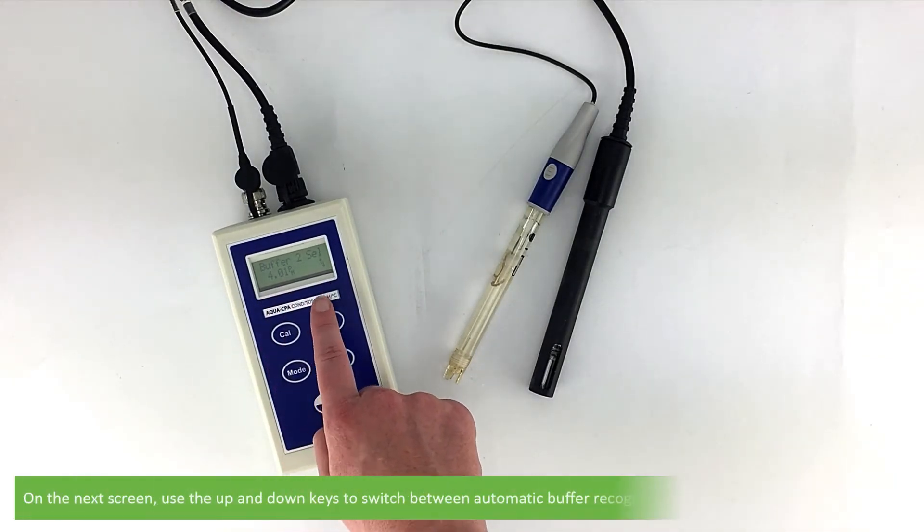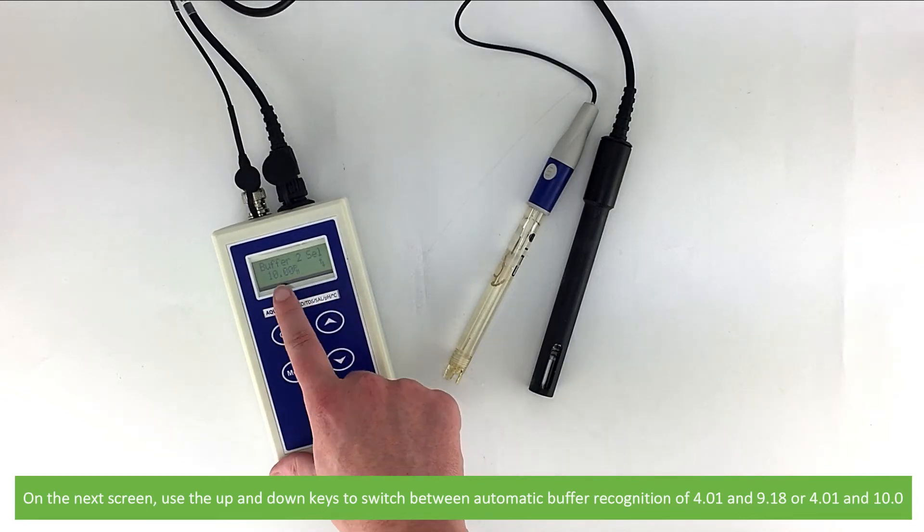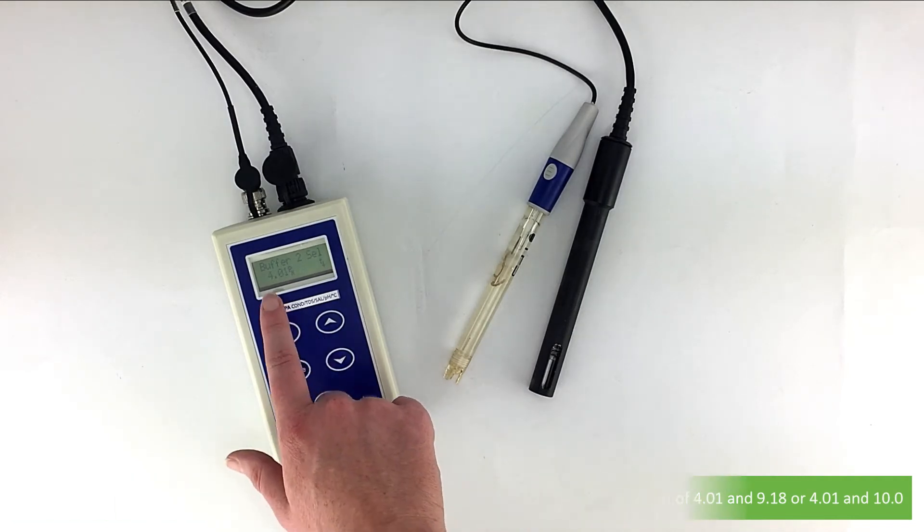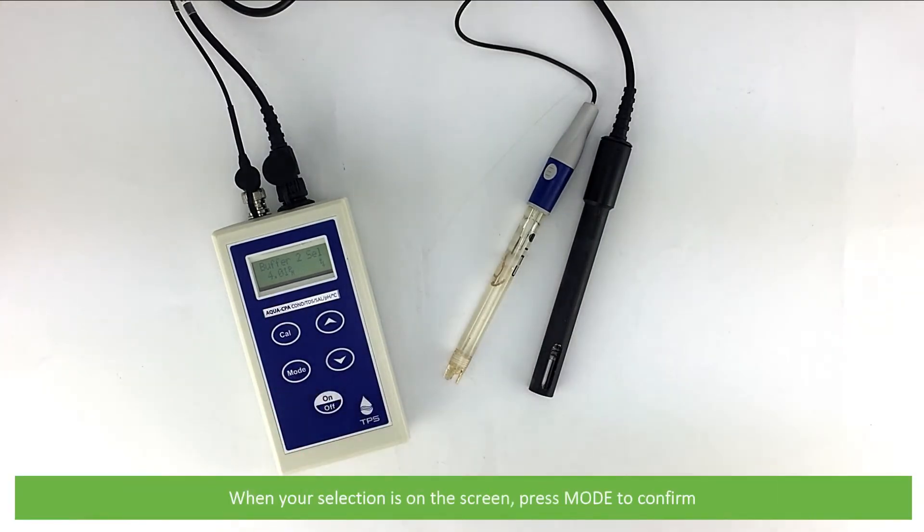On the next screen, use the up and down keys to switch between automatic buffer recognition of pH 4.01 and 9.18 or 4.01 and 10.0. When your selection is on the screen, press mode to confirm.